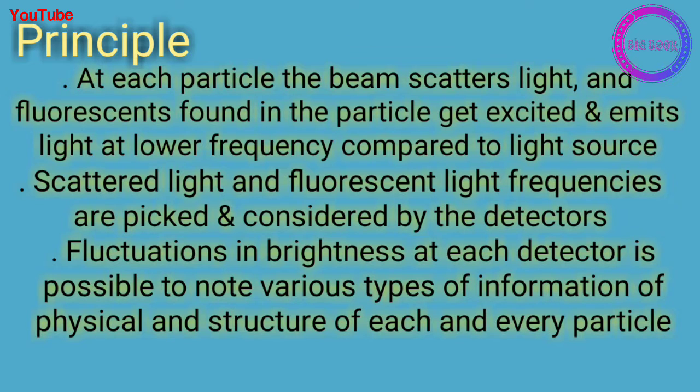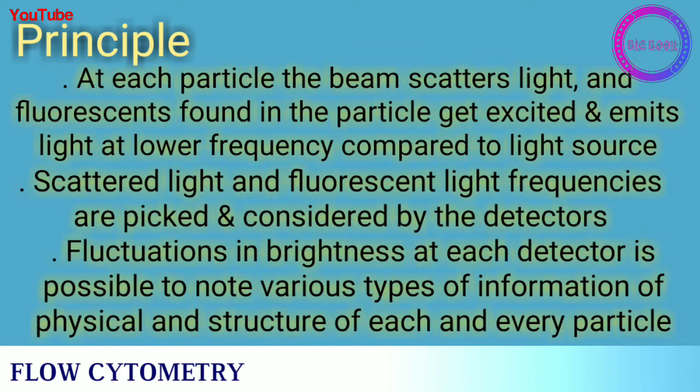Whatever multiparametric kind of measurements has already been decided, according to that the physical properties and structure of each and every particle or cell will be absorbed by the detector. Whatever the scatters they are going to get will be absorbed as signals, and that will be taken into the result within the computers.